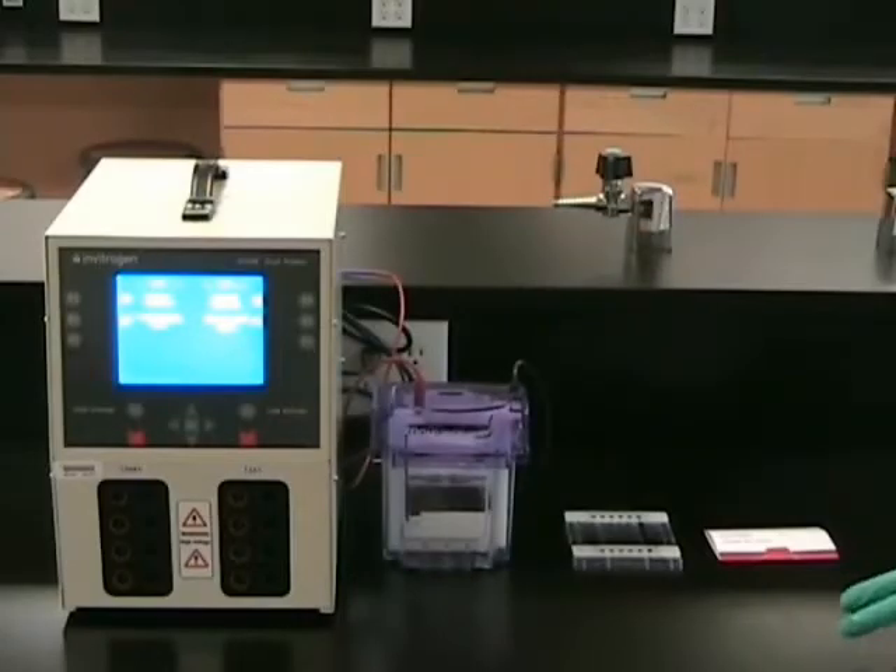In this video, we will be demonstrating how we can separate proteins using two-dimensional gel electrophoresis. The first dimension serves to separate proteins according to their isoelectric point, and the second dimension separates them according to their molecular mass.